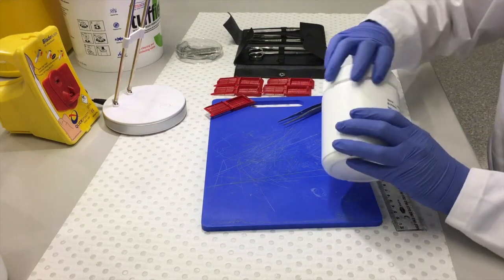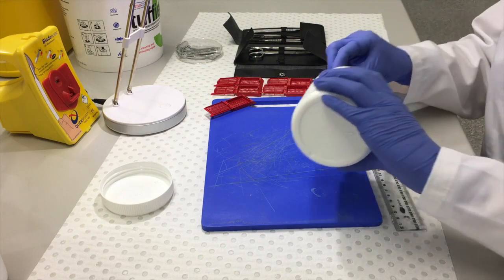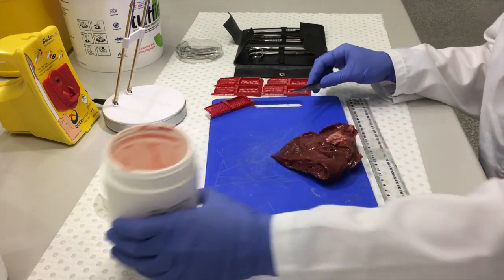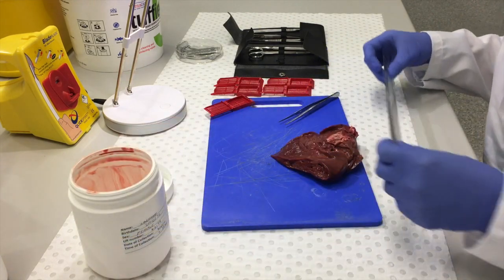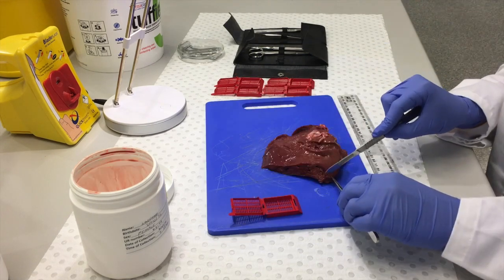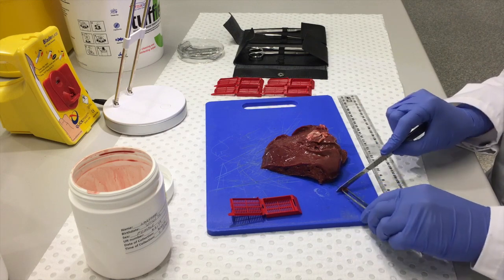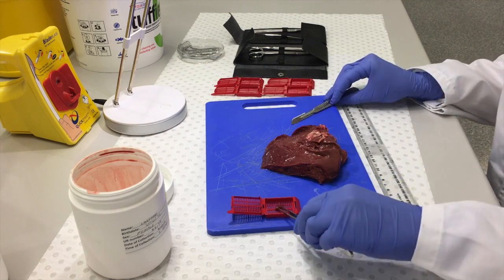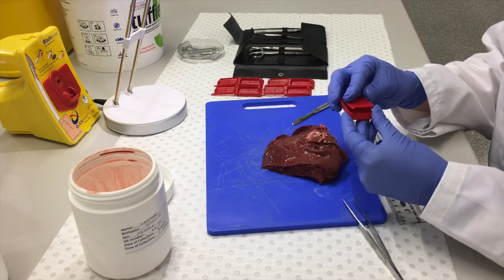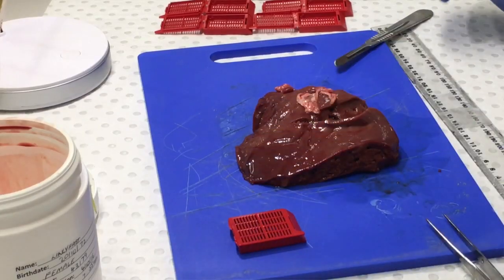After the specimen has been accessioned, the pathologist or the scientist conducts a gross examination, whereby the tissue is described and measured, and all or some of the tissue is prepared for tissue processing. Some of the tissue is removed from the organ and placed into a cassette. The cassette is able to hold the tissue in place while tissue processing occurs. The cassette is also used in the embedding process, which we will look at later on.